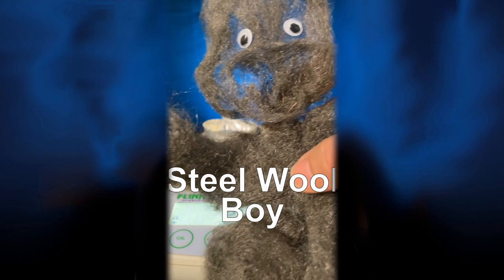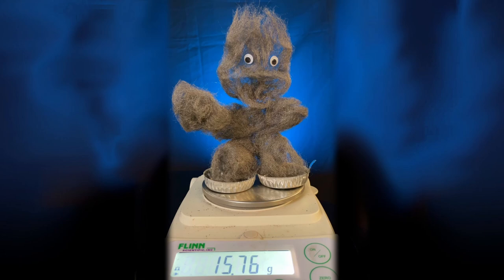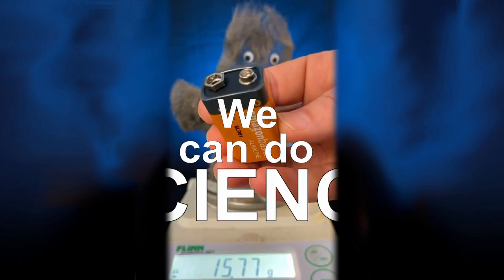Let's take these two dishes and steel wool boy. The dishes are for steel wool boy, one for each foot. Put him on the scale and notice his initial mass is about 15.76 grams. Powered by a 9-volt battery, we can do science.